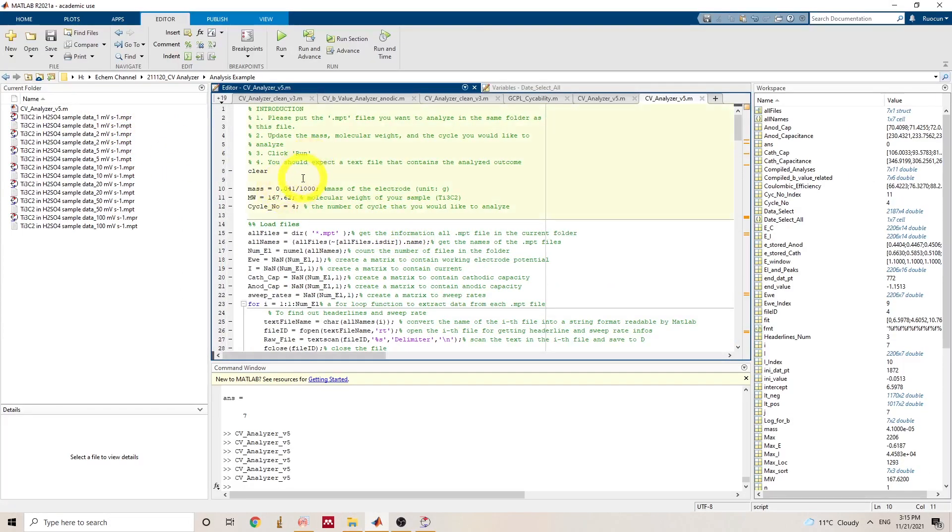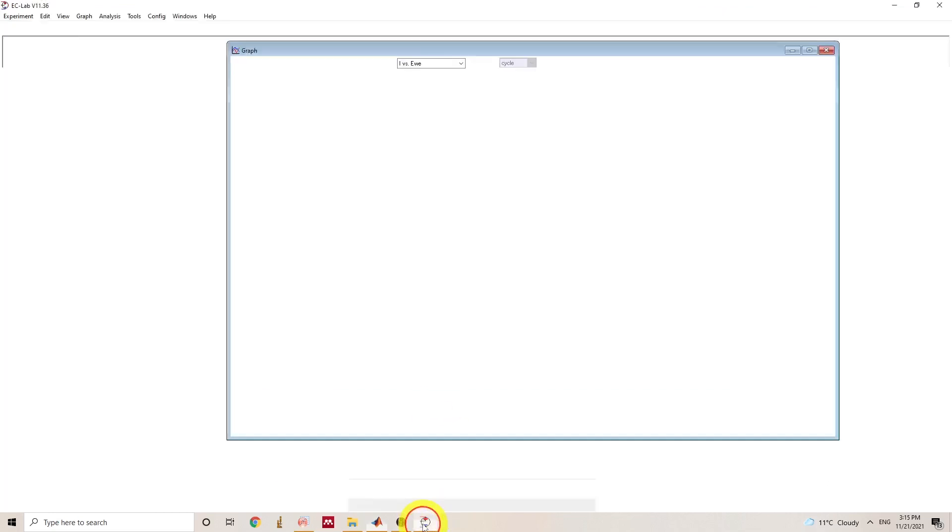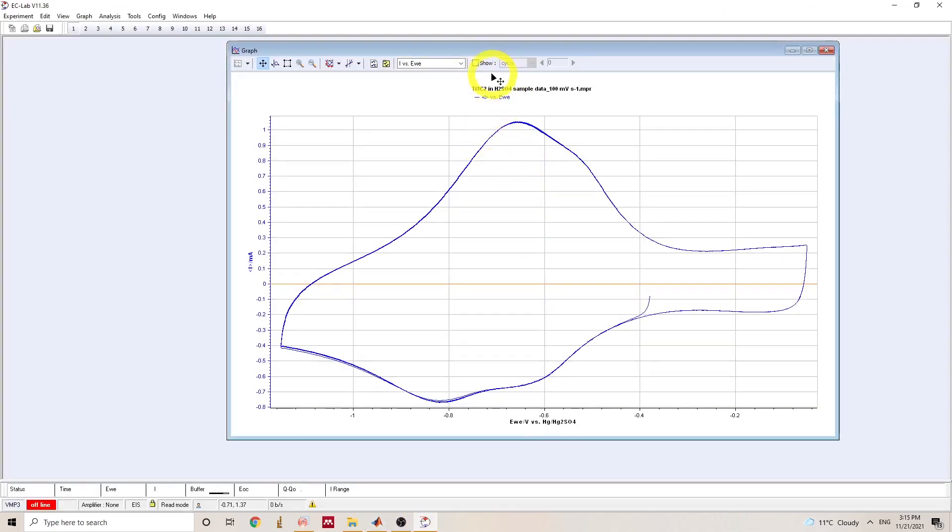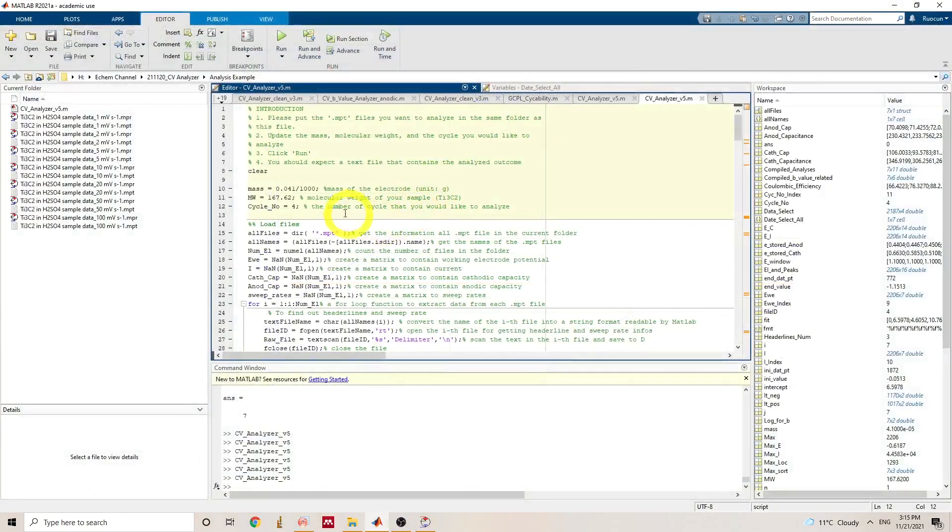And every time we run this code, we need to make sure this code is in the same folder as the MPT files. And we change the mass, molecular weight, and the number of cycles that we would like to analyze. So the CV I collected here have total seven cycles. So I picked four as the middle.